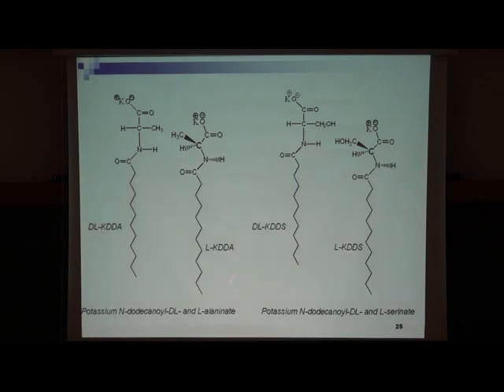We chose these amphiphiles because the chiral nematic phases by using alanine have pure chiral interactions. In other induced chiral nematic phases, you add a chiral molecule to the nematic phase. So these are more advantageous than the other ones.